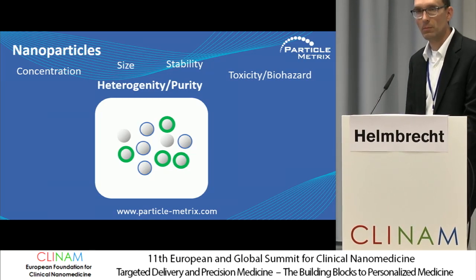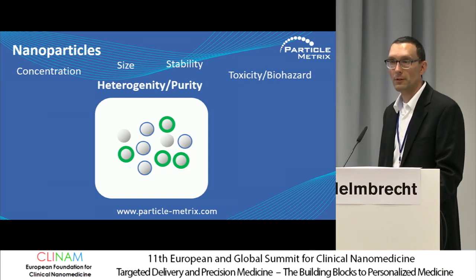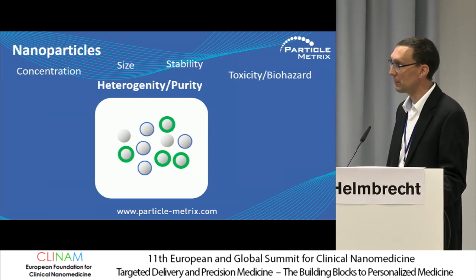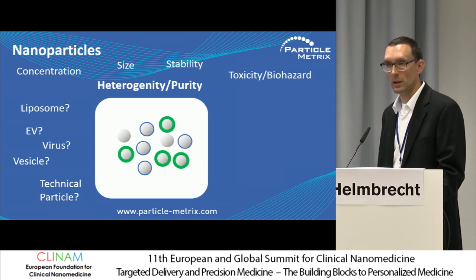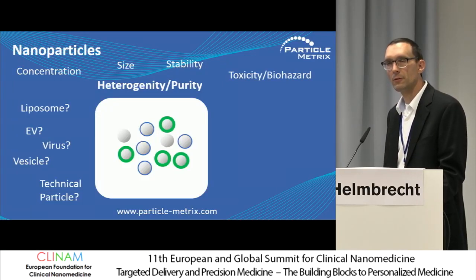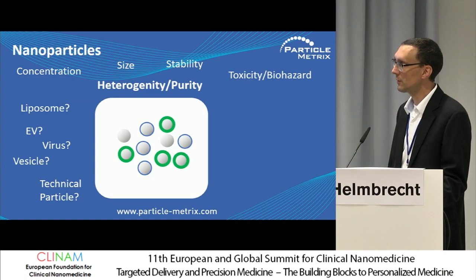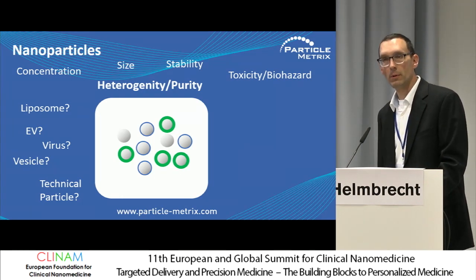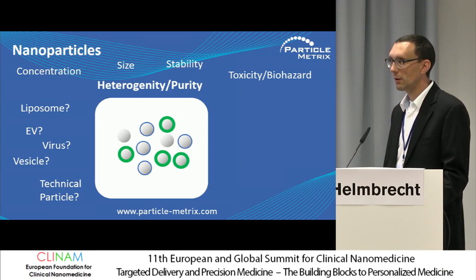toxicity, biohazard, but as well in the heterogeneity or in the purification, how pure is your sample. So basically, you as a user, most of the time you know what it is. So you have a lot of a priori knowledge. Is it a liposome, an EV? Is it a virus, a vesicle, or technical particles such as quantum nanodots or SPION particles or artificial particles?